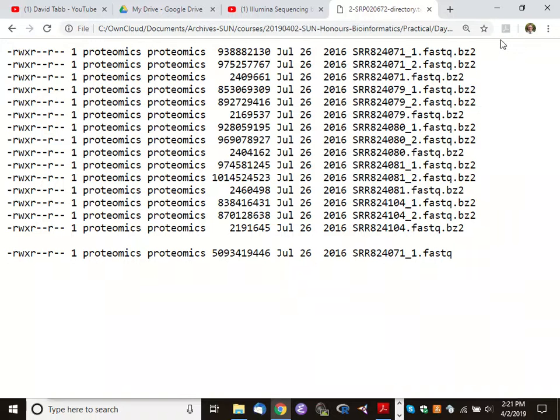See, this is where we get burned for my not having taught the first lecture of the series on computer science. BZ2 is a compressed format. It's a lossless compression format that allows us to squeeze down these data very, very tightly. So we see that this first file right here has been compressed. Now we can look down here and see the same file name, this time without BZ2. So you're probably accustomed to seeing stuff like .zip, zip files. Yeah, zip is another kind of lossless compression.